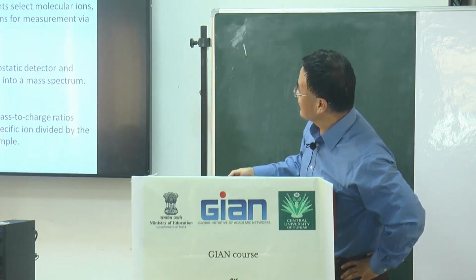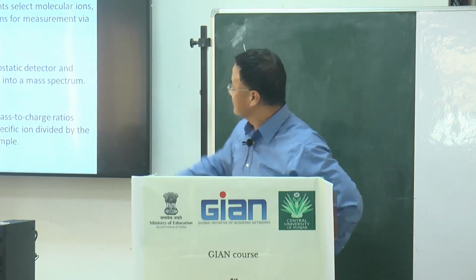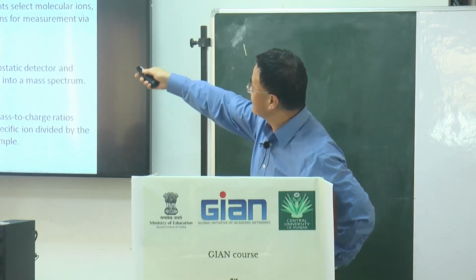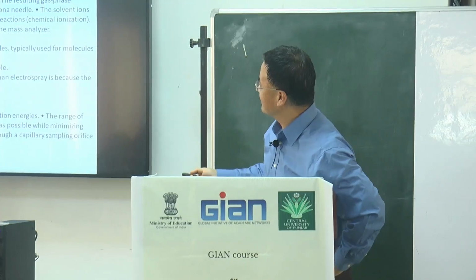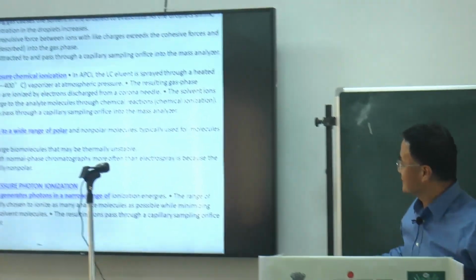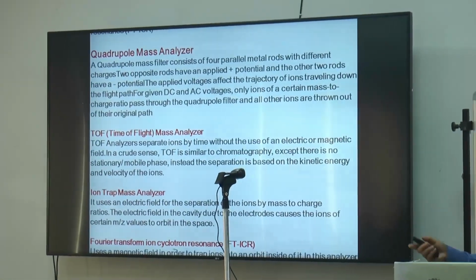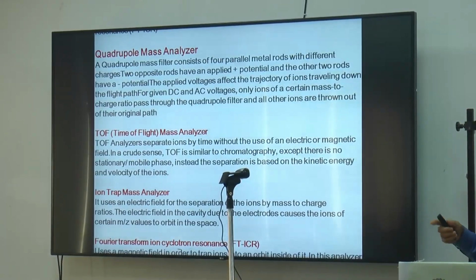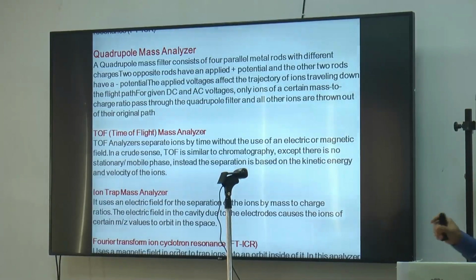Yesterday we talked about the several ionization methods and also the detector, the mass spectrometer. There are several types; we will continue to talk about ionization, several different ways. In GCMS we usually use electron ionization, but chemical ionization is also very often applied.